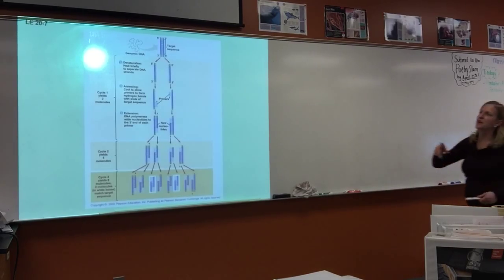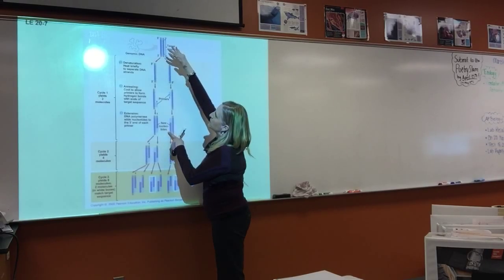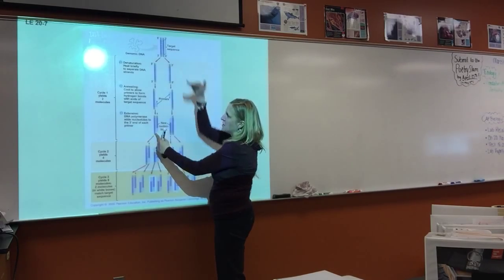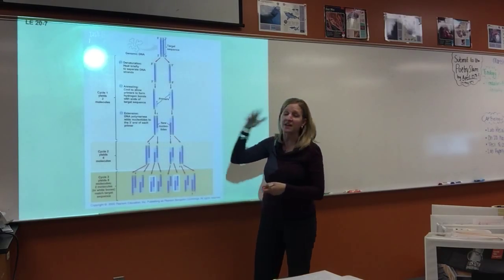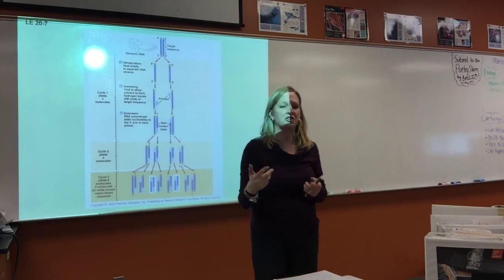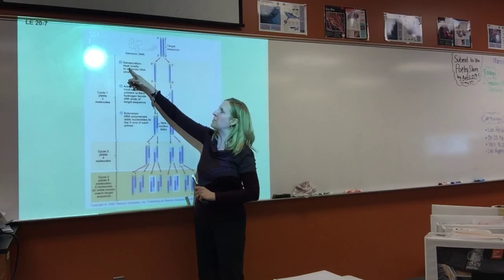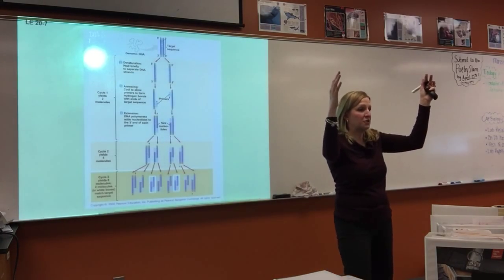So what we have here, if this is your DNA, what we want to do is replicate it. So we're starting out, this is the DNA we want to sequence or to replicate, and then we end up from 1 to 2. So that's the overall big picture. What happens in this machine is DNA replication. So what do we need for DNA replication? You have to have the two sides of the DNA separate. That's the heating part, the denaturation, so the hydrogen bonds break between the two sides.